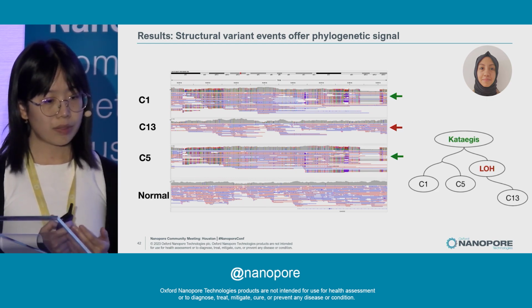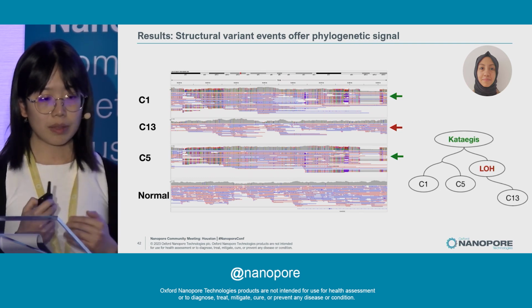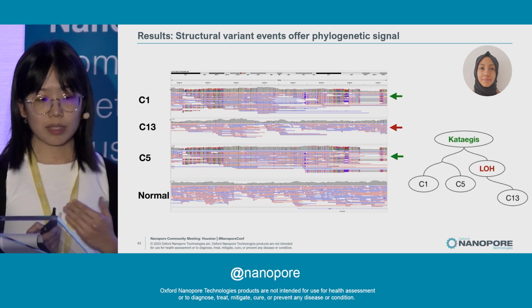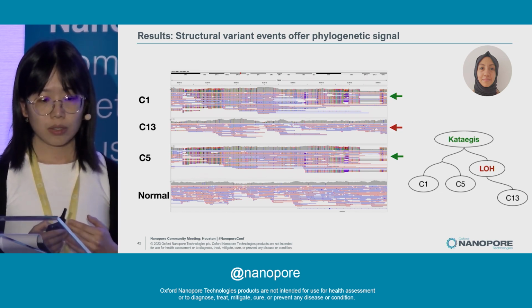We plan to construct phylogenies using only small variants and then only using structural variants, compare them with a methylation-based phylogeny, see if there are inconsistencies or ambiguities, then see if an integrated approach leveraging phylogenetic information from all three sources of signal could resolve some of the ambiguities in an improved phylogeny.